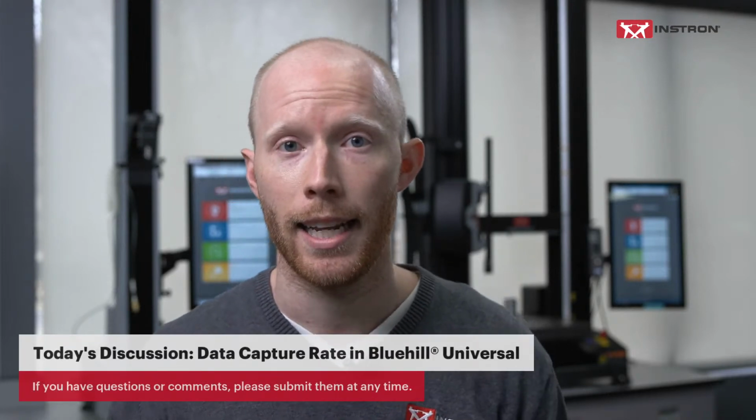My name is Dan Caesar. I manage our Bluehill product portfolio. That's a software application that we use here at Instron to operate our test frames. And today, our session is going to focus on data capture rate.